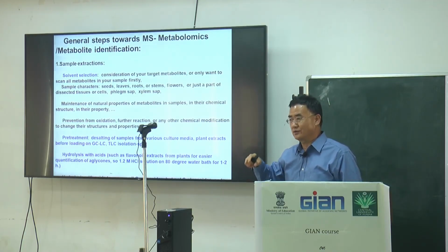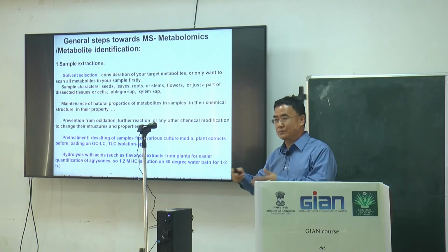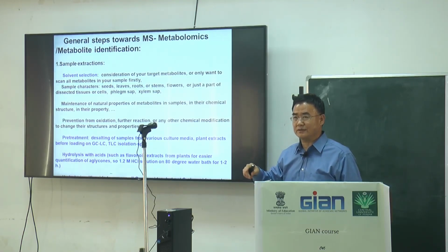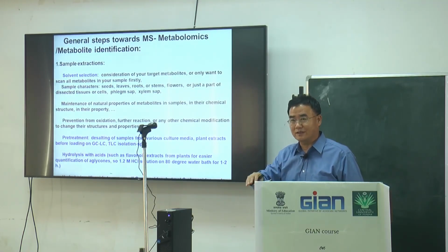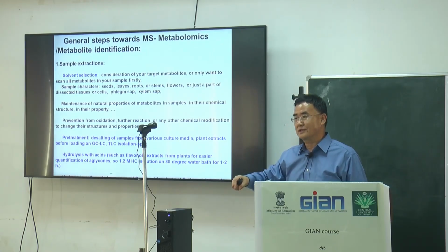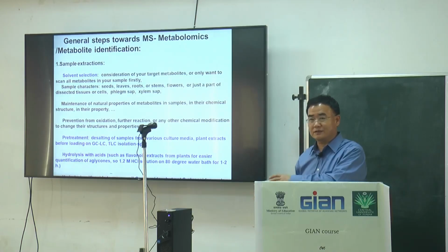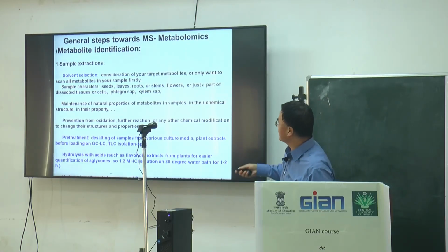Small molecule alcohol has very quick penetration into the tissue. Then enhance it with sonication, and always under cold conditions. Even with sonication, don't exceed 30 minutes. Or better, put ice into the water bath to maintain the temperature and not overheat, which would cause sample oxidation.